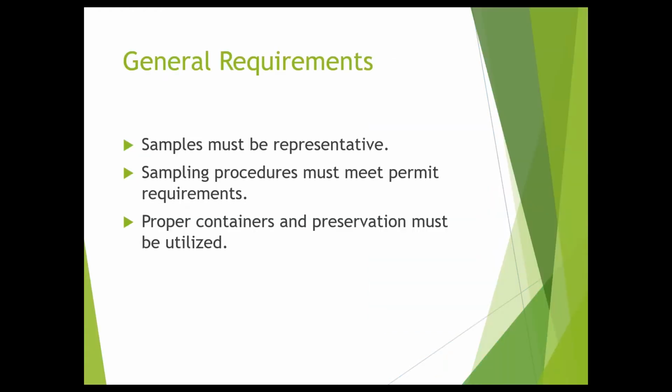The general requirement for sampling, the whole point of it, is that it must be representative. So imagine you go into Sam's and they give you a sample of one of the drinks, and you buy that drink and you go home. You fully expect that that drink tastes the same as the sample that you collected. And if it tastes different, you're going to want to take it back. Well, this is the same thing. Your sample should be representative of what you're actually sampling from, your larger pool. So if it's influent, your sample should be representative of your influent. If it's a process sample, your sample should be representative of whatever tub or vat that you're picking up from in your process, and the effluent likewise.